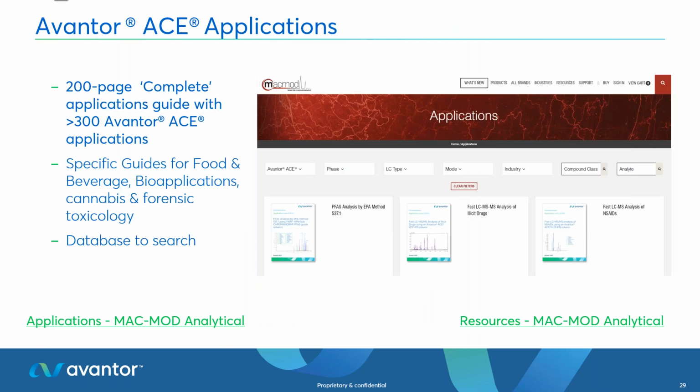I'd always look at the analyte chemistry when you're starting out your method development. Go back, look at what types of columns have been used for certain applications, and MacMod have got a great database you can go into, as well as individual resources based on different application areas. So that's a good place to start if you can't do a full 6-column screen as well.